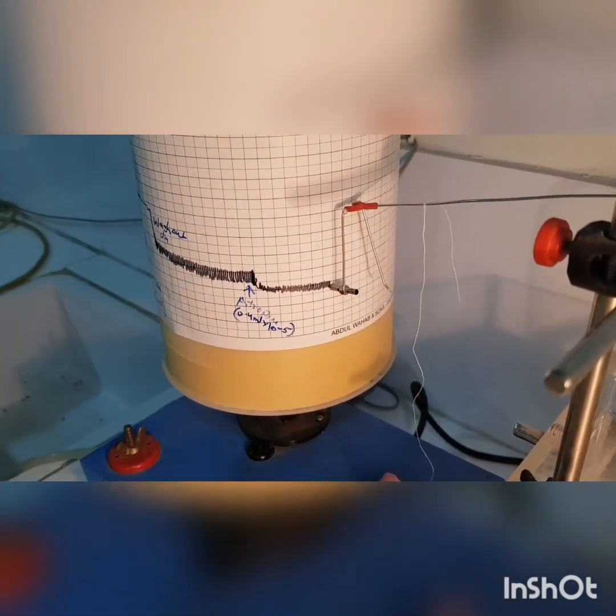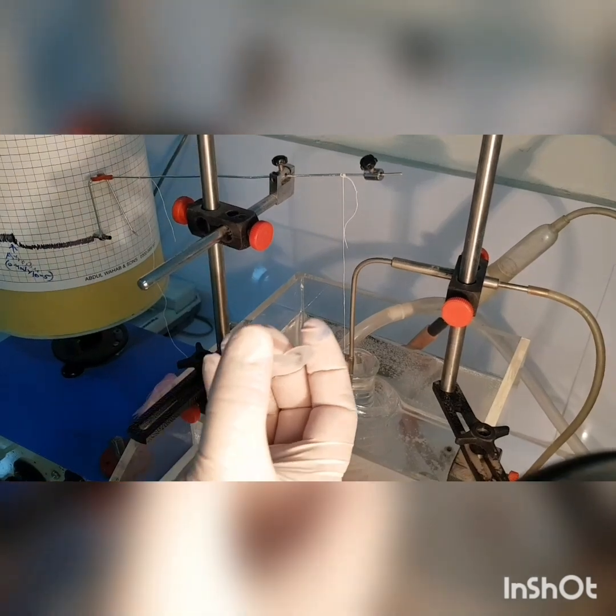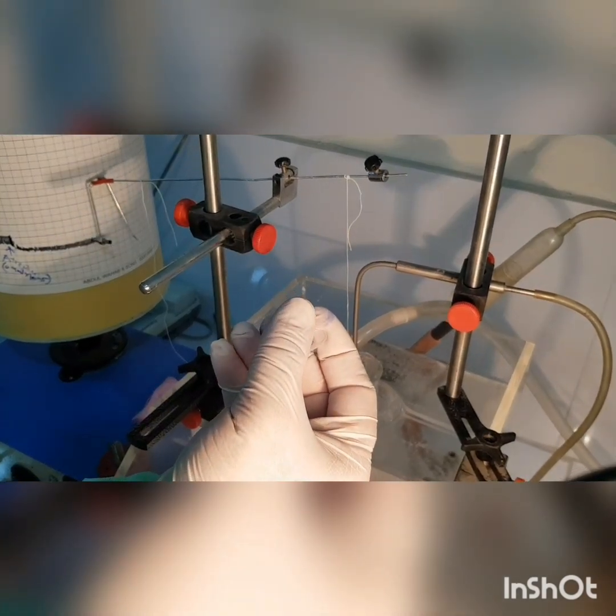In the presence of the antagonist, we will give the agonist. Now we are giving the agonist.